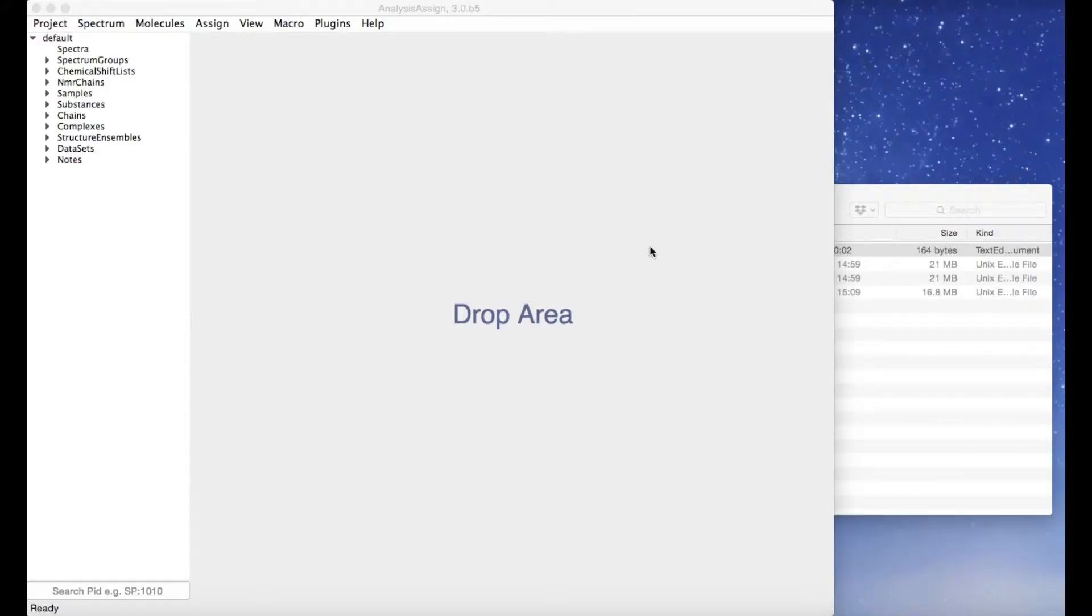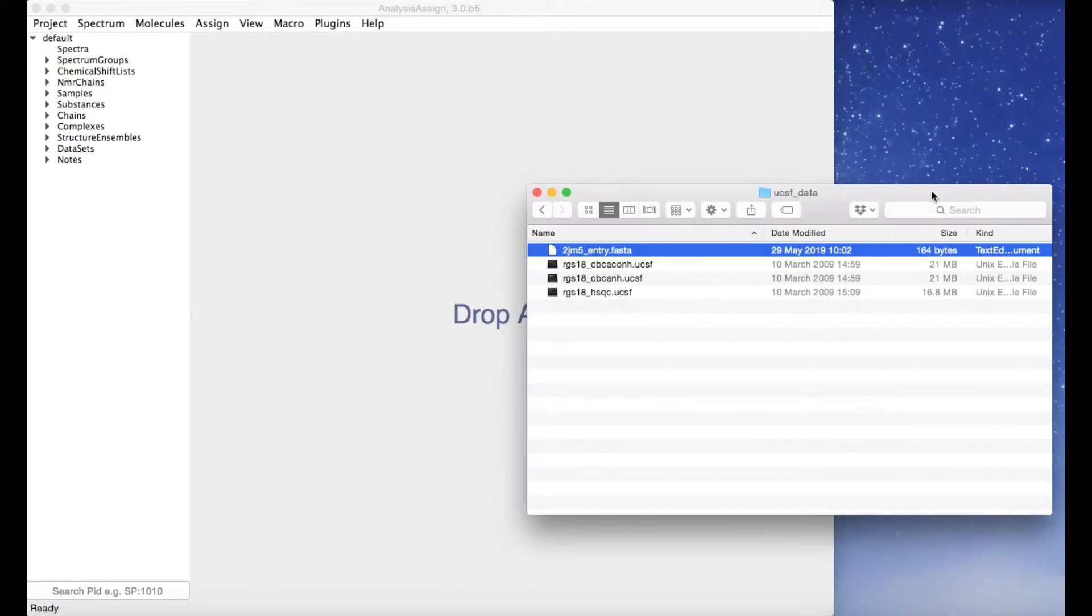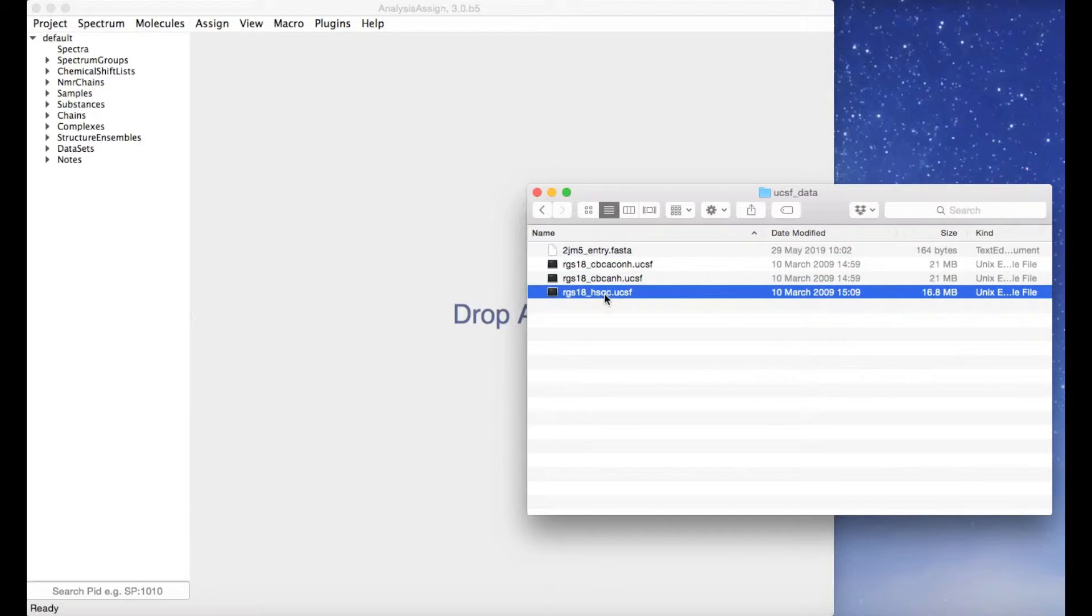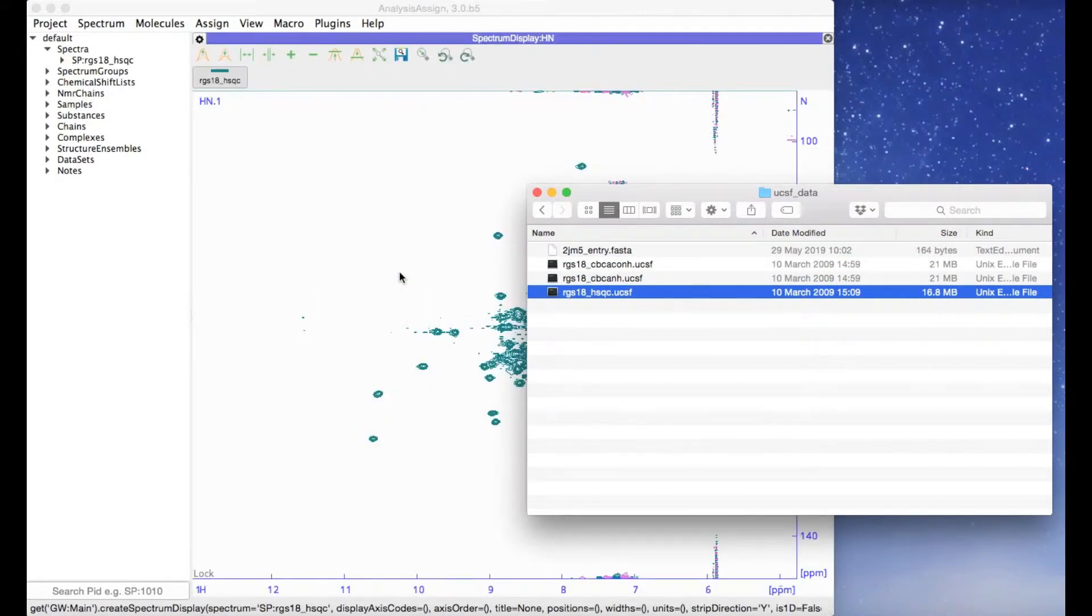In version 3 of Analysis, you can just drag and drop any of your data into the project and it will open immediately. No matter what format your spectra's in, whether it's UCSF, Bruker, or NMR Pipe, just take your file, drag and drop it and it will open.